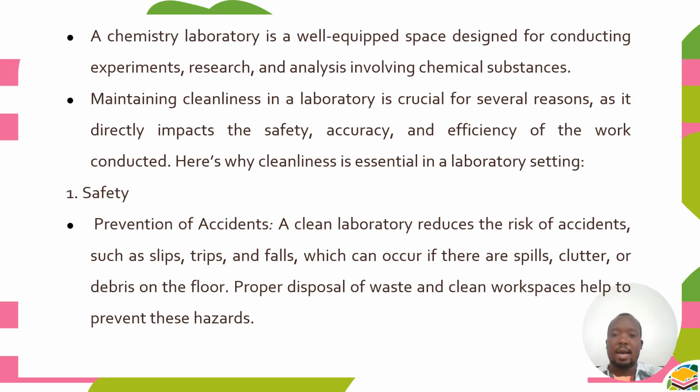Now, as a reminder, before we go straight into the laboratory safety measures, let us remind one another on what a chemistry lab is and the roles it plays. A chemistry laboratory is a well-equipped space designed for conducting experiments, research, and analysis involving chemical substances.